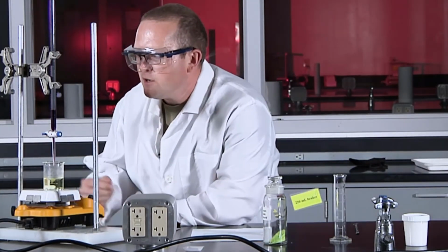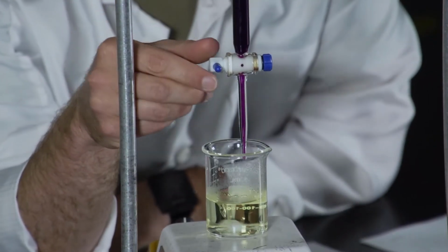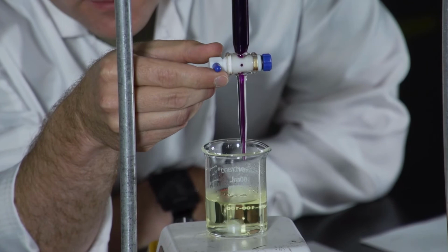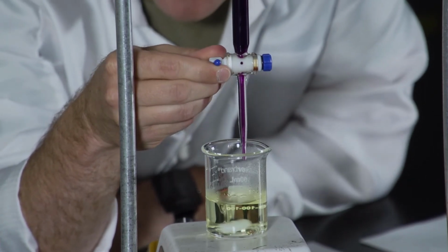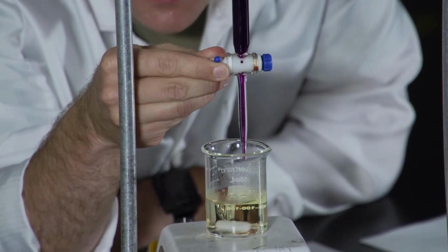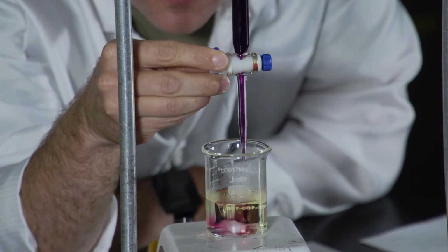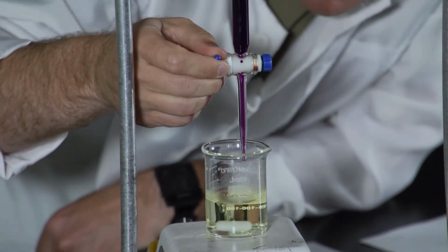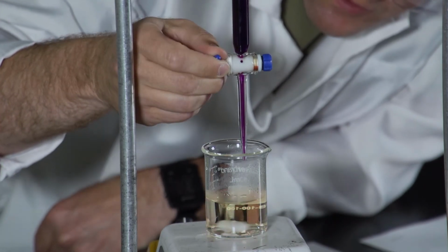Okay, so here we are getting close to the endpoint. You can tell because the solution has gotten a lot paler in yellow-green color. So I'm just going to start to go real slow. And eventually I'll just go dropwise because I don't want to pass that endpoint.